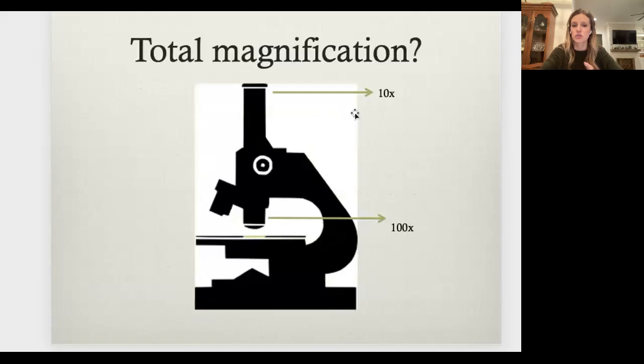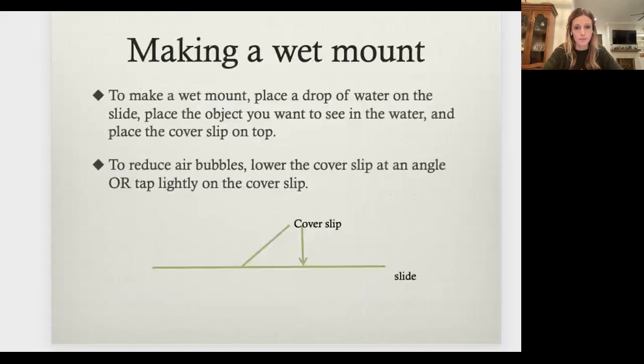Total magnification. This is what I was talking about, okay? So what would be the total magnification of this? You would do 10 times 100 equals 1,000. So your total magnification would be 1,000, okay?